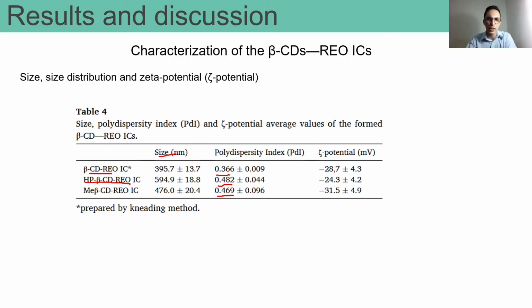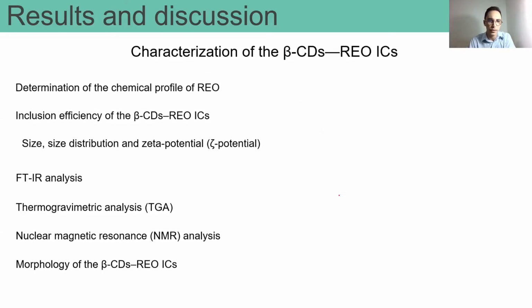And in the zeta potential we have values that tell us we have equilibrated particles, so they are stable with the millivolts that they have.